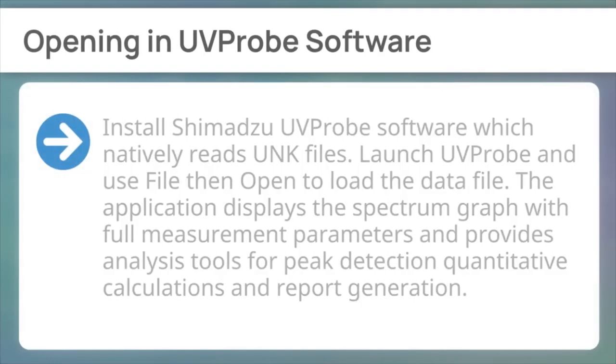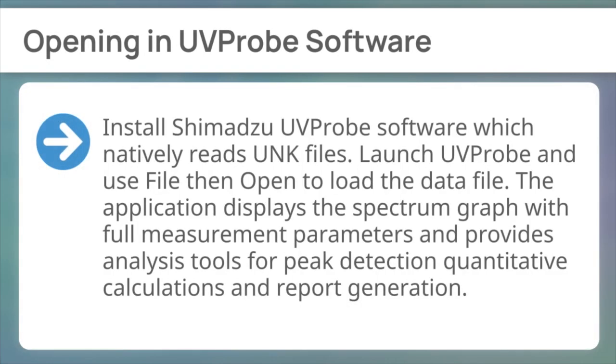First, opening in UVProbe software. Install Shimadzu UVProbe software, which natively reads UNK files. Launch UVProbe and use File then Open to load the data file. The application displays the spectrum graph with full measurement parameters and provides analysis tools for peak detection, quantitative calculations, and report generation.